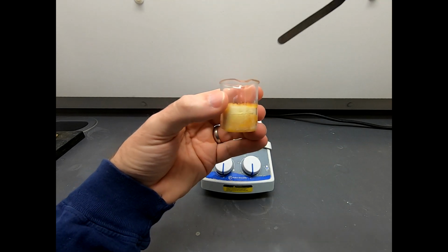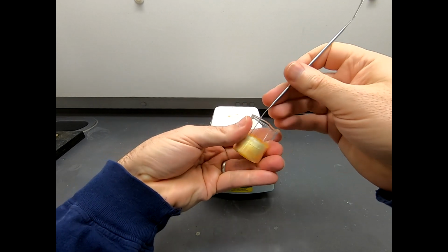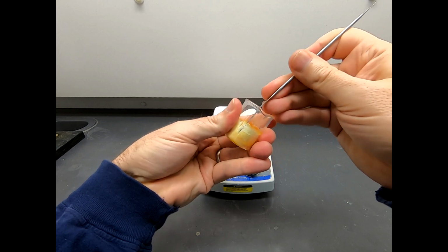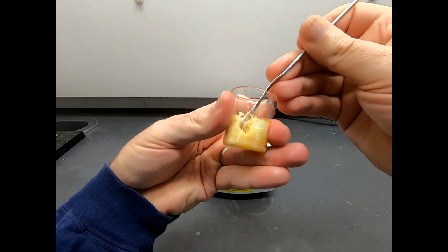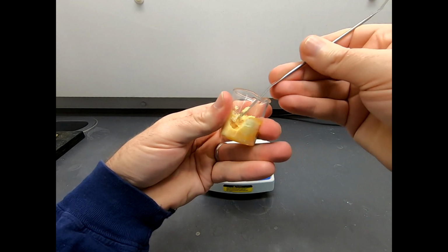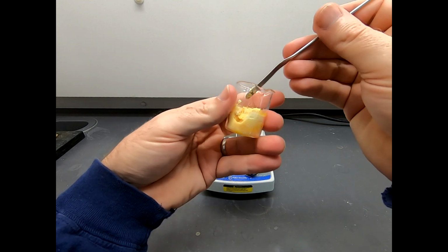So what needs to happen is I will try to break this up as best as I can and as finely as I can. And once I'm satisfied with that, you can see I'm kind of pushing this to the side and digging a hole there. Once I'm satisfied that this is fairly well broken up, we'll go ahead and transfer this to water.